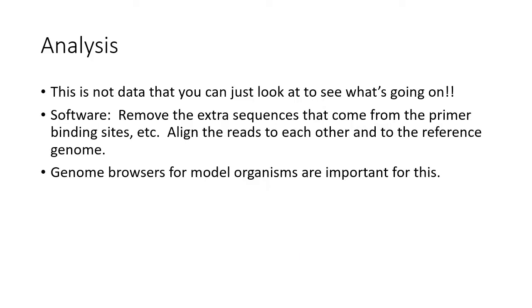So, analysis. This is not data you can just sit down and look at, right? There's very elaborate and sophisticated software to deal with the data that is generated, which is, of course, huge if you have millions of sequences going on at once. The software is able to remove the extra sequences that come from things like primer, etc. But importantly, the reads need to be aligned to each other and to a reference genome, if you're lucky, right? There are genome browsers for model organisms that make this very much doable. It's much harder if you don't have a reference genome, but not impossible.